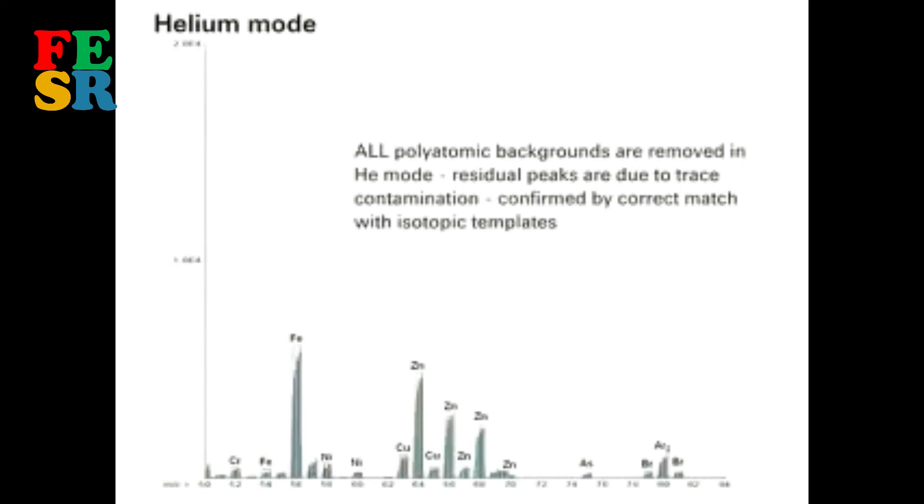Now watch what happens when helium is added to the cell. All matrix-based interferences are removed. The remaining elemental peaks are due to parts-per-billion level contamination in the matrix. This is confirmed by the correct isotopic template fit.